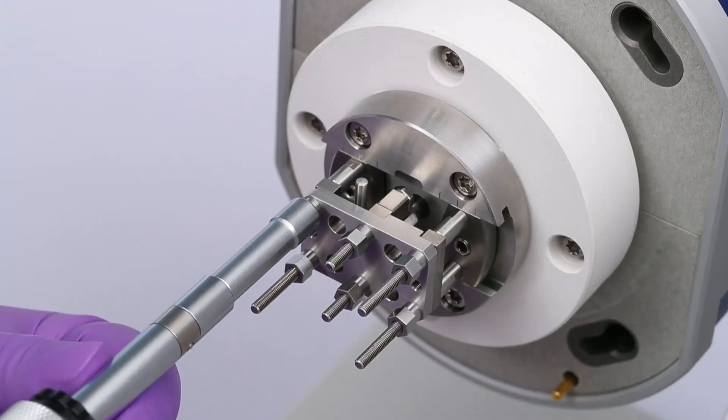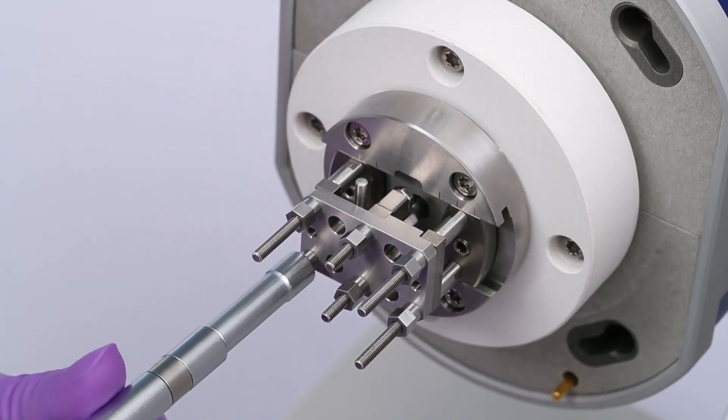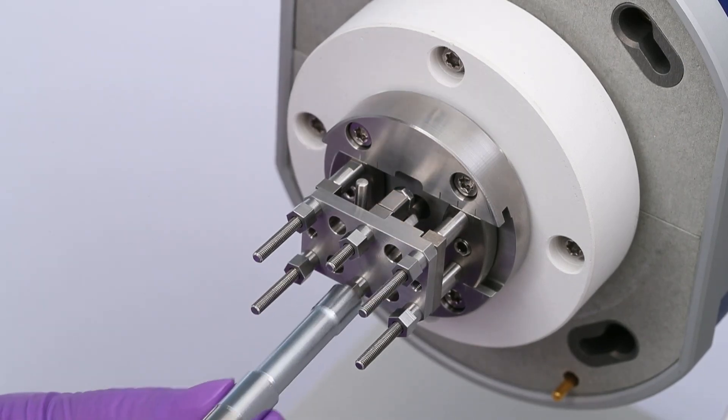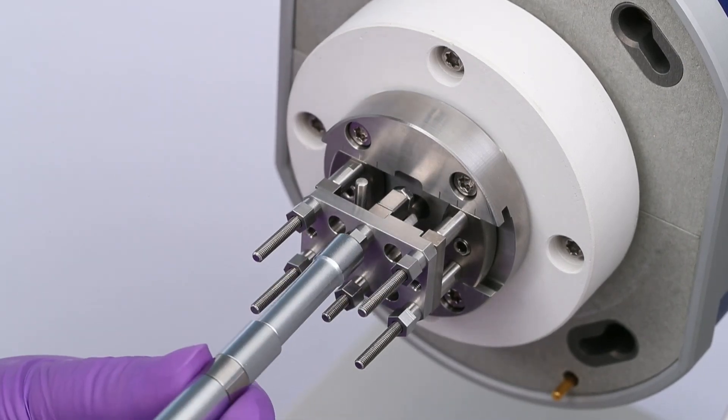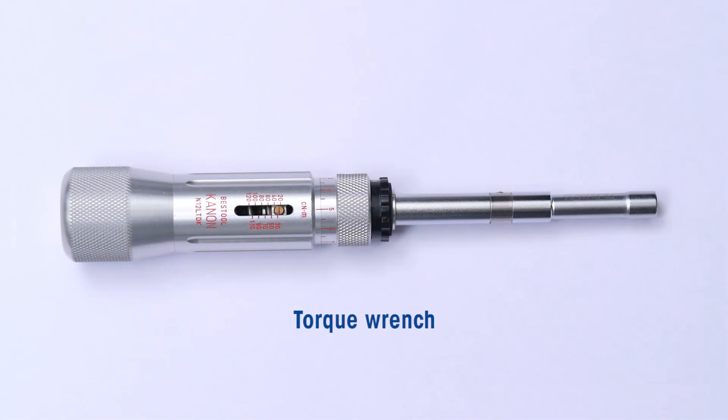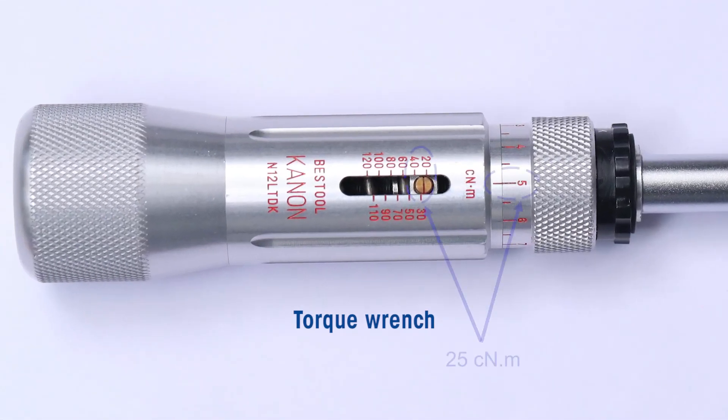Fasten the alignment insert with four outer extended nuts, followed by two middle extended nuts using the torque wrench, which must be set to a torque of 25 cN·m.